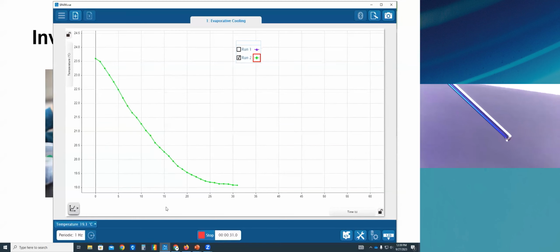And if you're looking at the zoomed in picture of the stainless steel probe, you can see that there is a drop there, but it's smaller. But the data is flattening out already. It seems to have reached its minimum. And every slow little bit, you can tell that the drop is getting a little bit smaller as opposed to the water, which stayed there much longer. So again, I'm going to move my mouse over here so you can see by 60, it's going to stop on its own. It's preset to stop after 60 seconds.